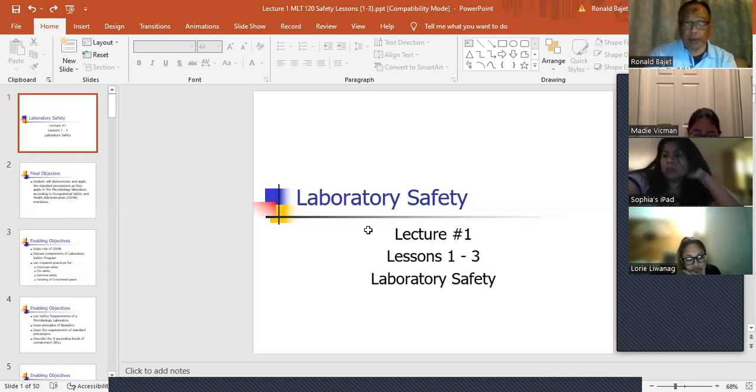So when you get into the microbiology, you're not only going to do catalase tests or indole tests or gram stains. Those are all elementary. Those are all baseline tests that every microbiologist should know. So this semester, I want to take it up to a higher level where you're going to get plates in front of you as they are submitted to you in the microbiology laboratory. You're going to say, okay, what's going on? And is it junk or do I do a workup?